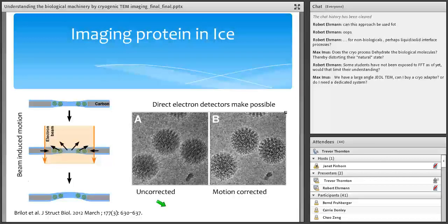It's wonderful when you think about the physics, because I worked on a helium microscope, and we used to burn holes in the water that was frozen at 4 degrees Kelvin. Wow. And the hole would seal itself up again after a few minutes, because the water at that low a temperature still flows. And so what we have to do because of this motion is to correct for that movement.